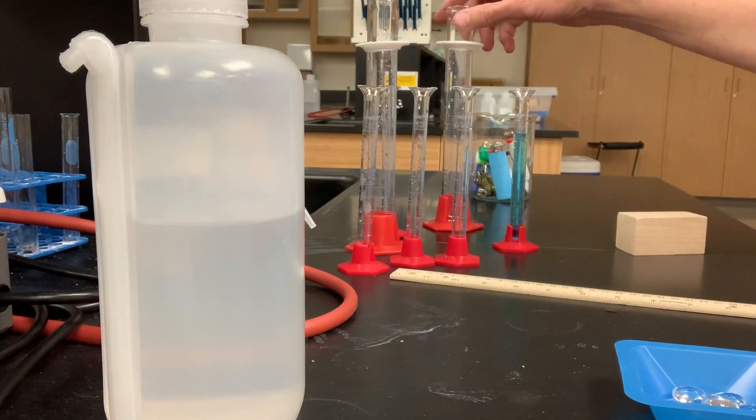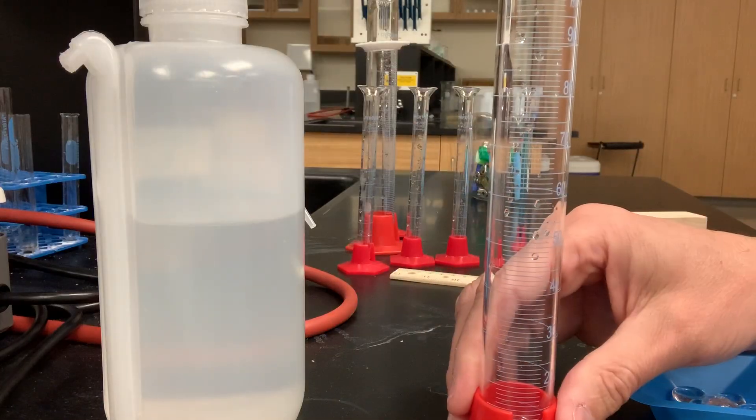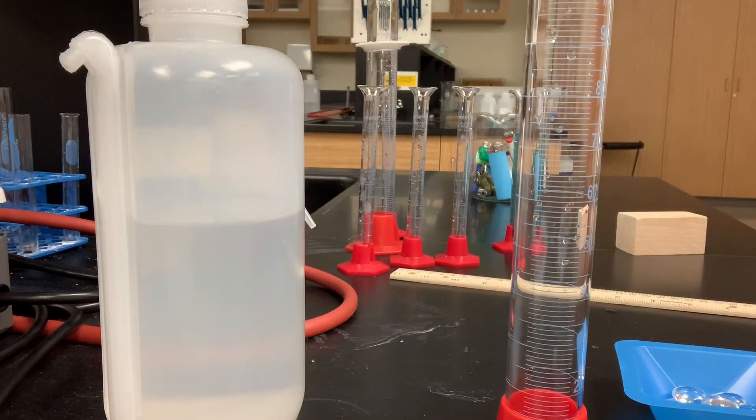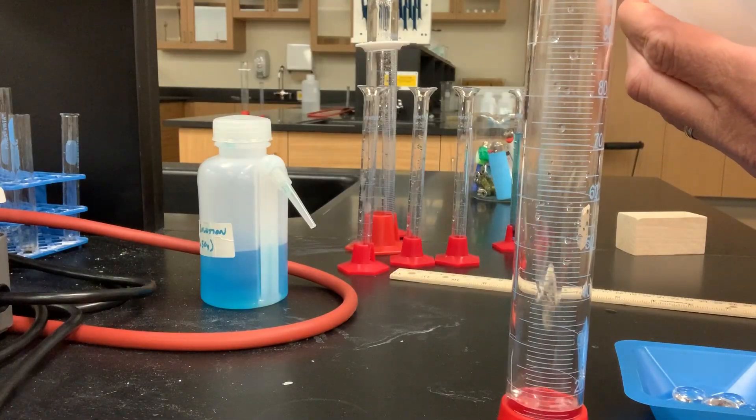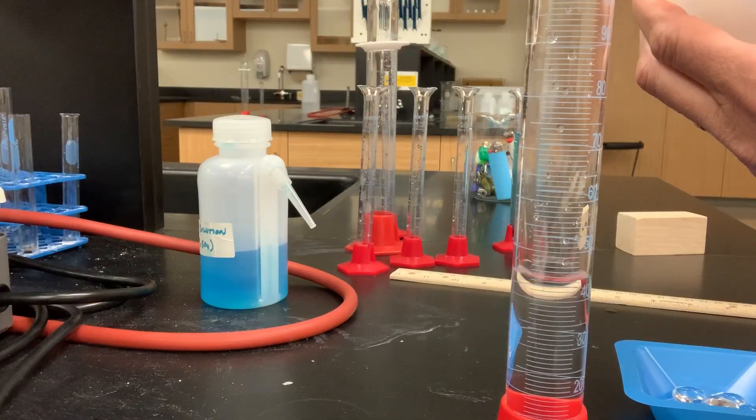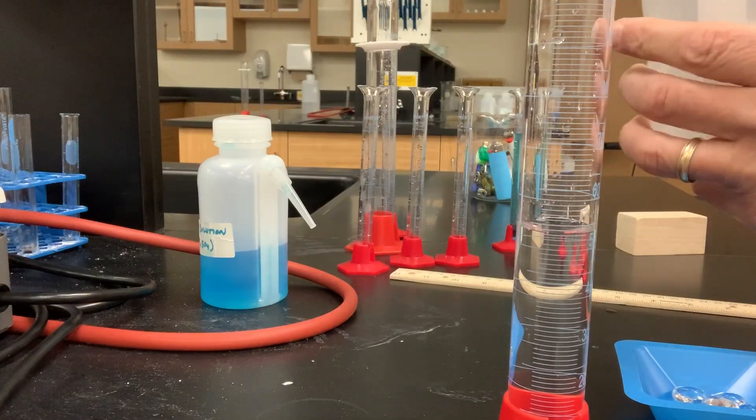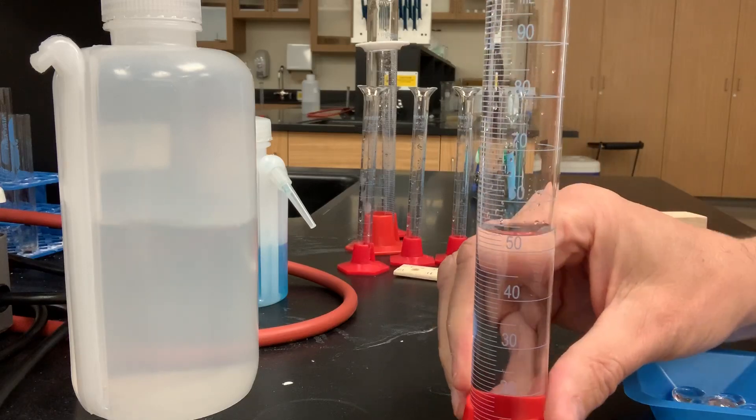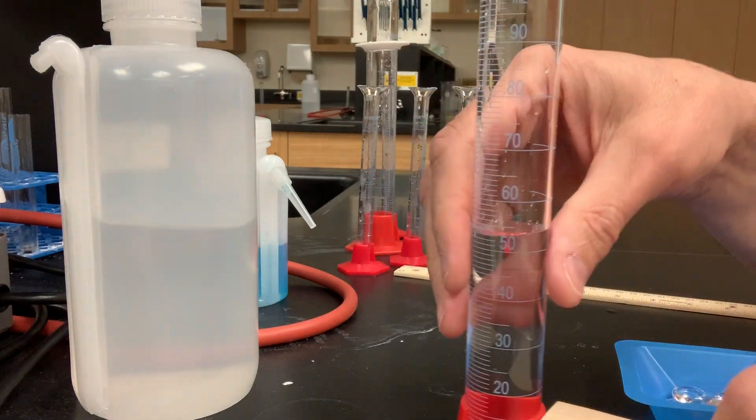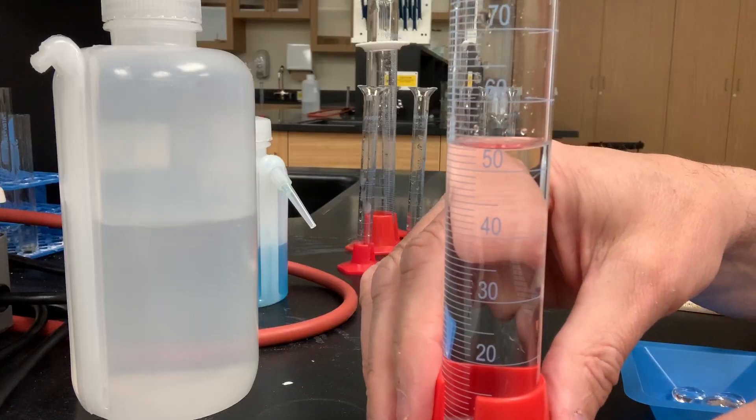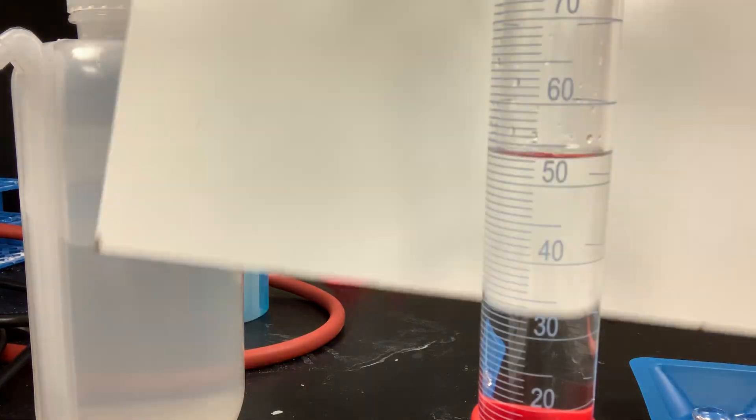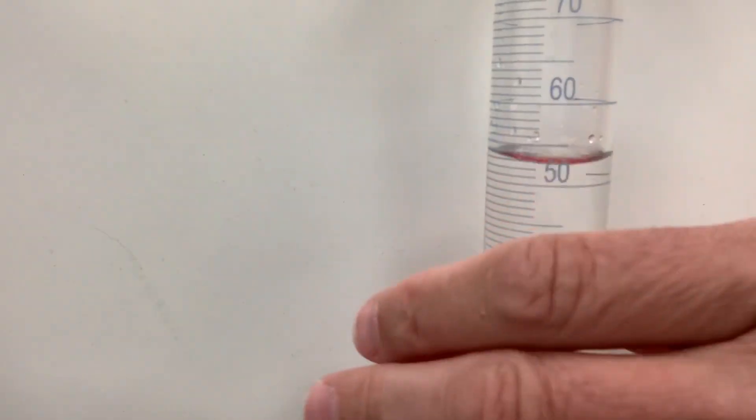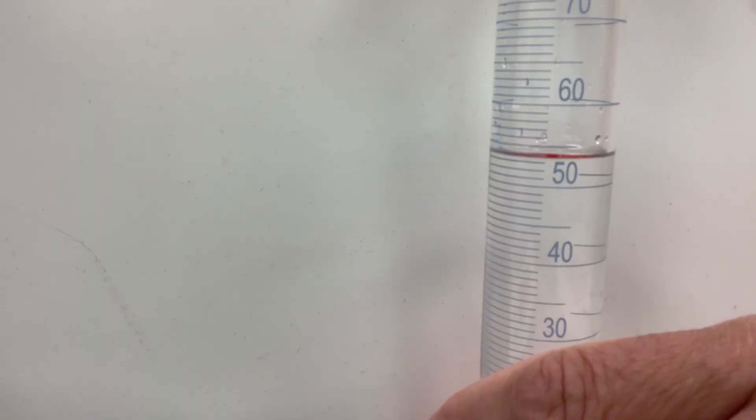Now, we need to find their volume, don't we? We're going to do that by water displacement. So, we'll take a graduated cylinder that's larger than our 10-millimeter graduated cylinder. We'll put some water in there. That's probably enough right there. And we'll need to take an initial volume measurement with my water and my graduated cylinders. This is without the glass beads, kiddos. So, here we go. I'll put my little white background here for you. And it looks like it's between 50 and 60 mils. Can you guys get a nice reading there?